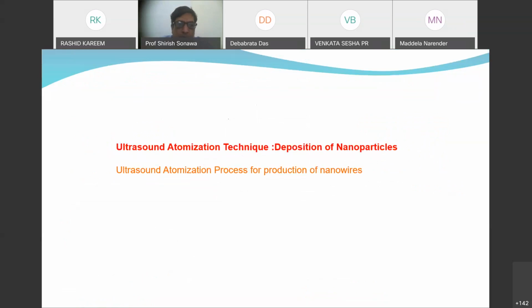Now we will go through one more important methodology, what is called an atomization process.